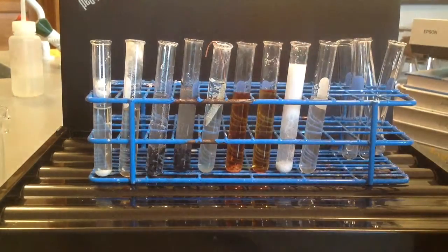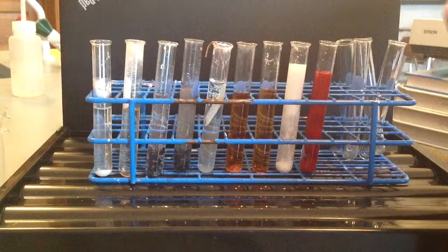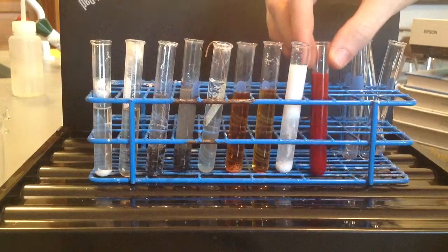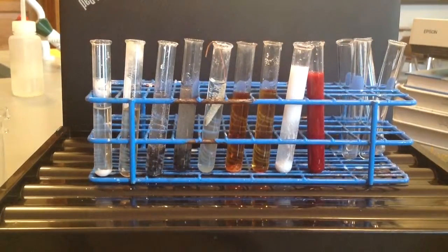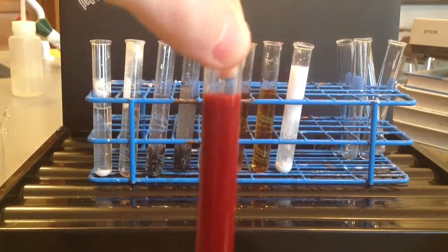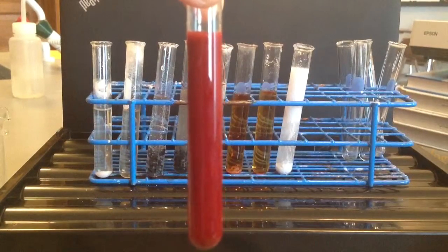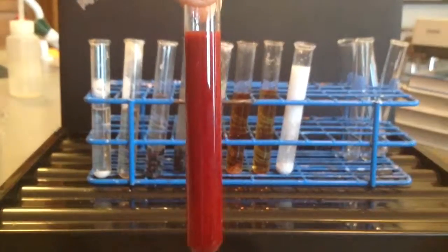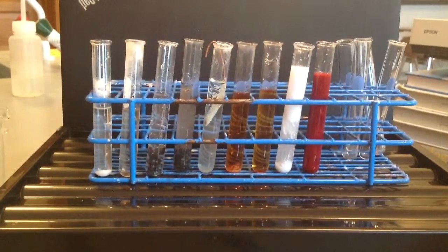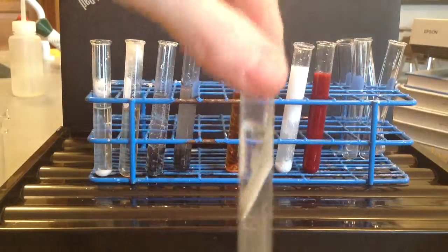Oh, here comes the chromate. All right, there you go. Okay, so that is that one. I'll bring it in a little bit closer so you can get a closer look at it if you want. Okay, there you go. And let's come back to our silver nitrate and copper wire since now it's been 15 minutes. And so you can see, I'll bring it in a little bit closer for you to take a look at.